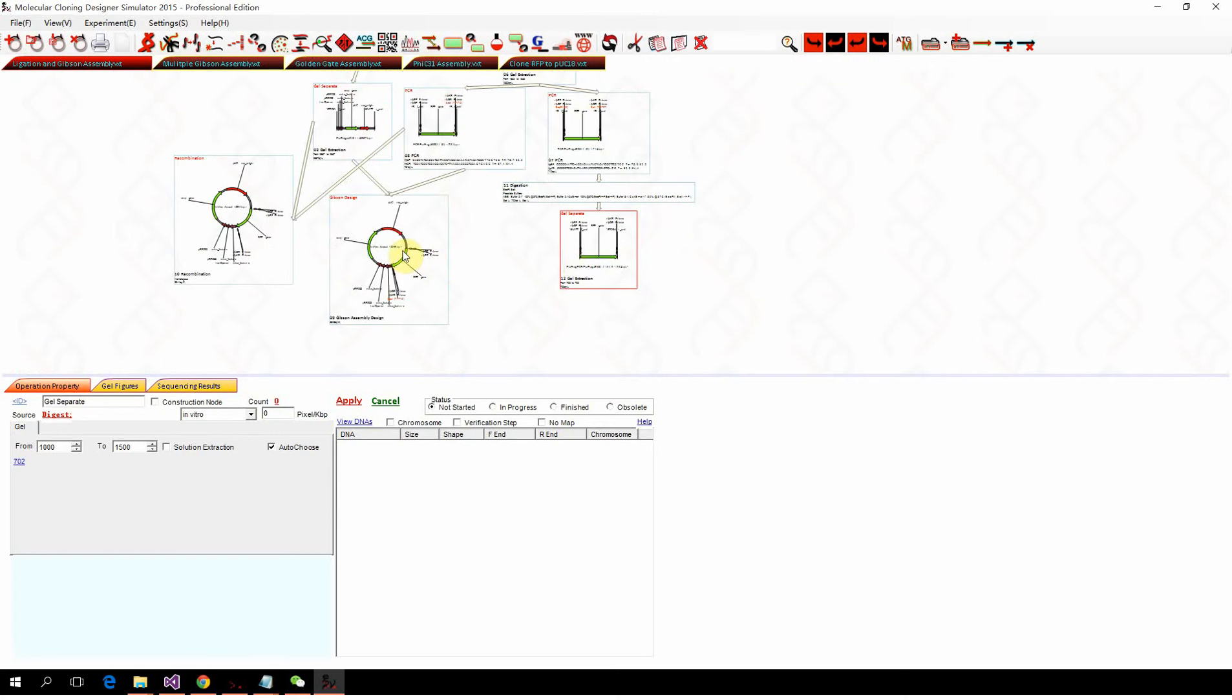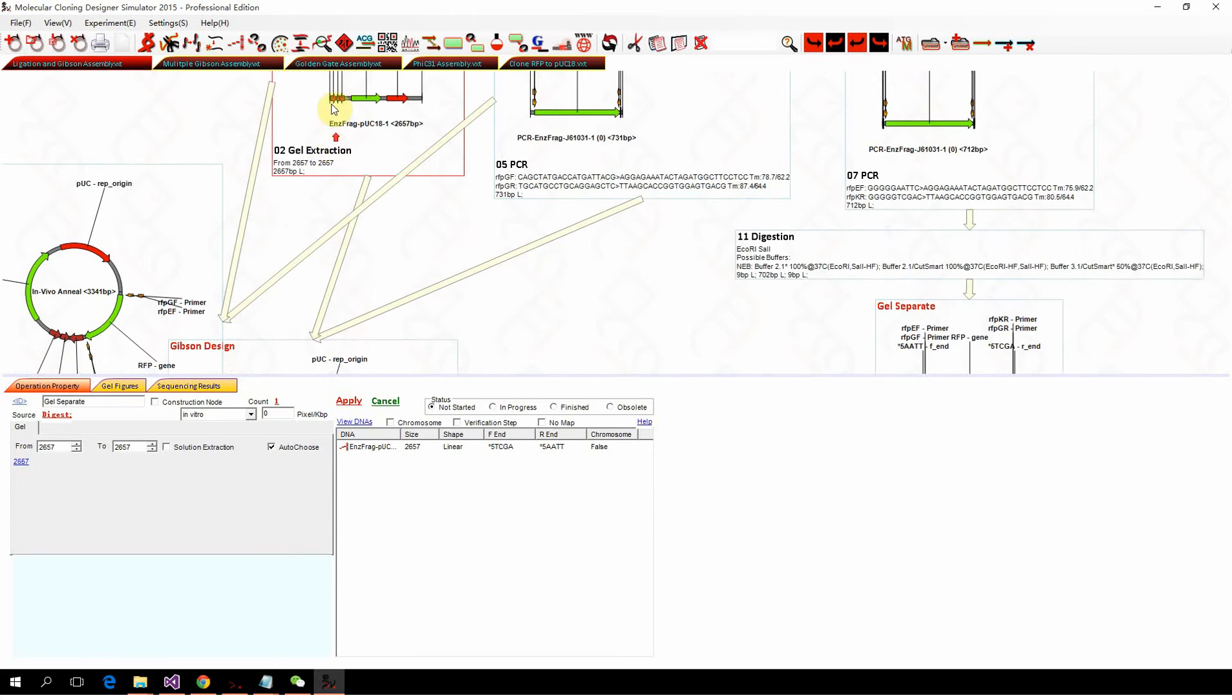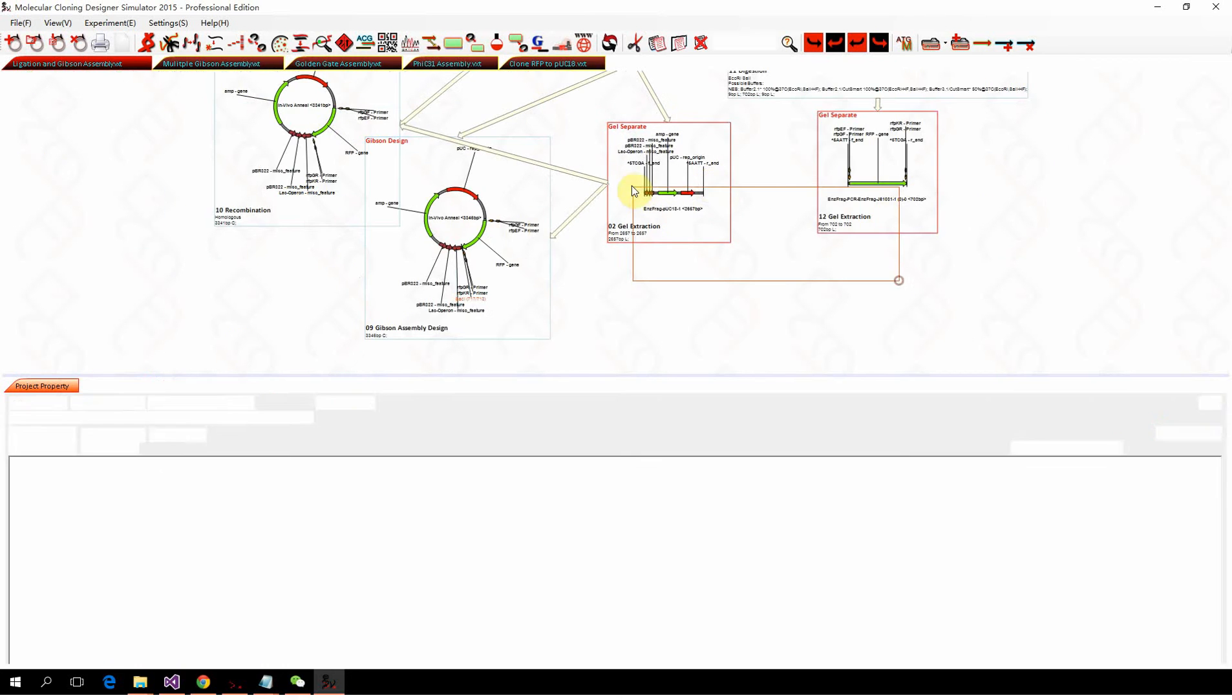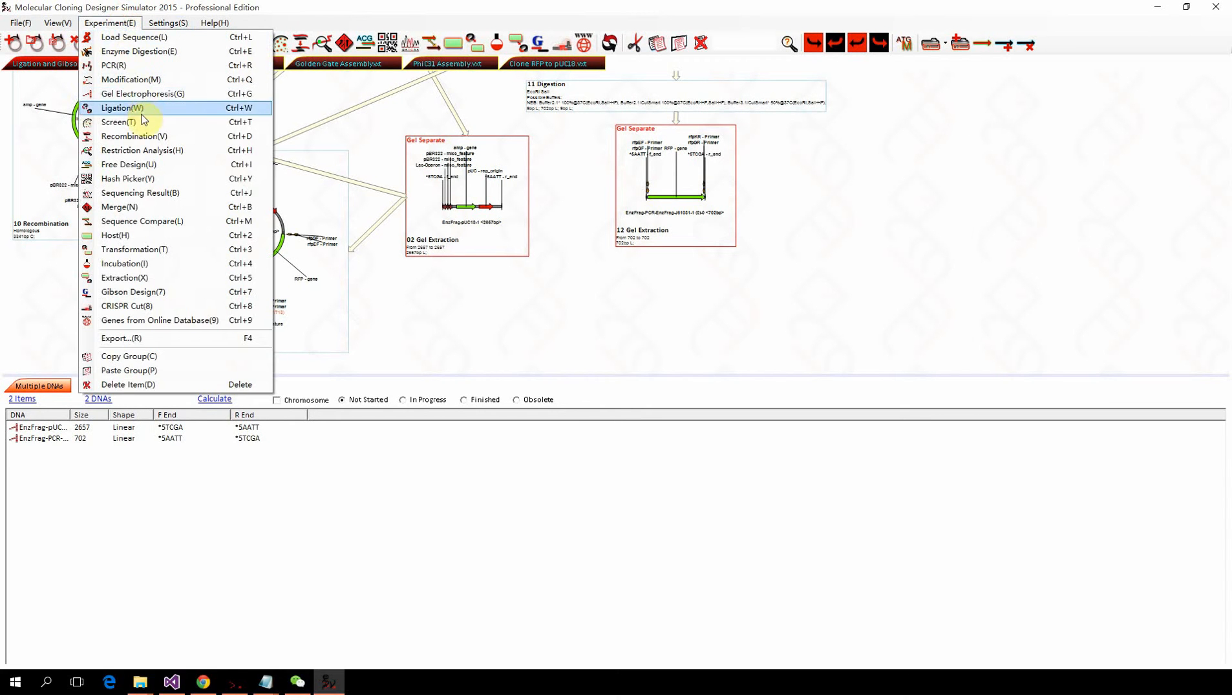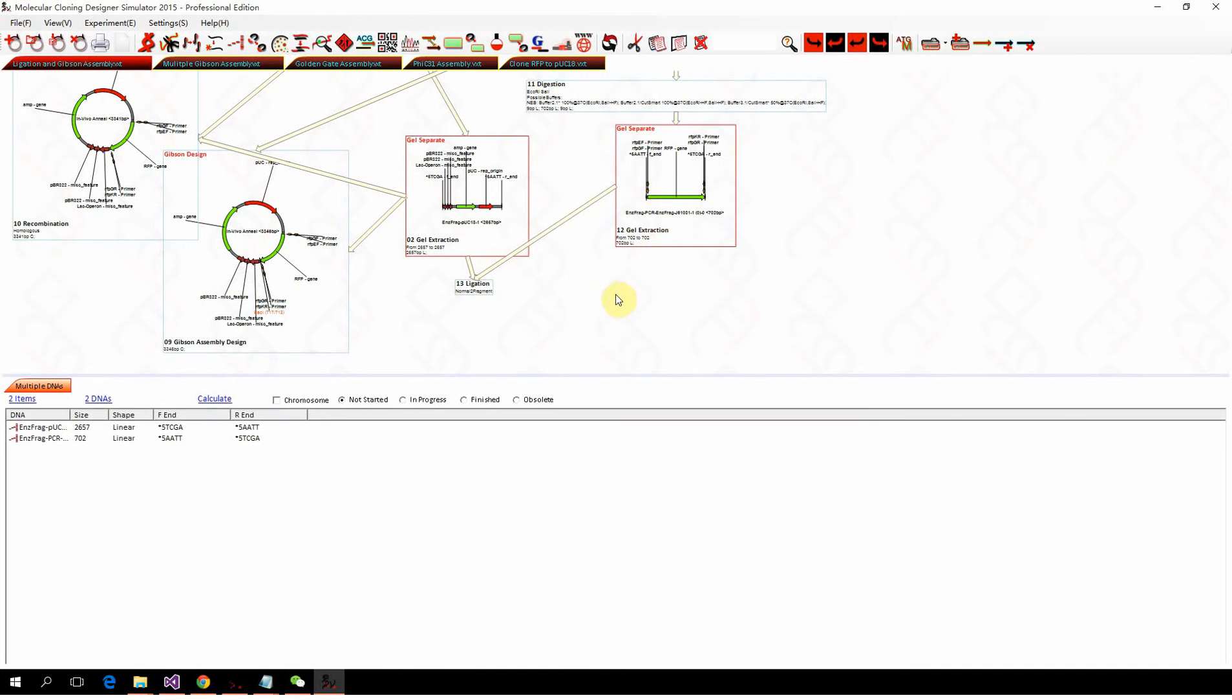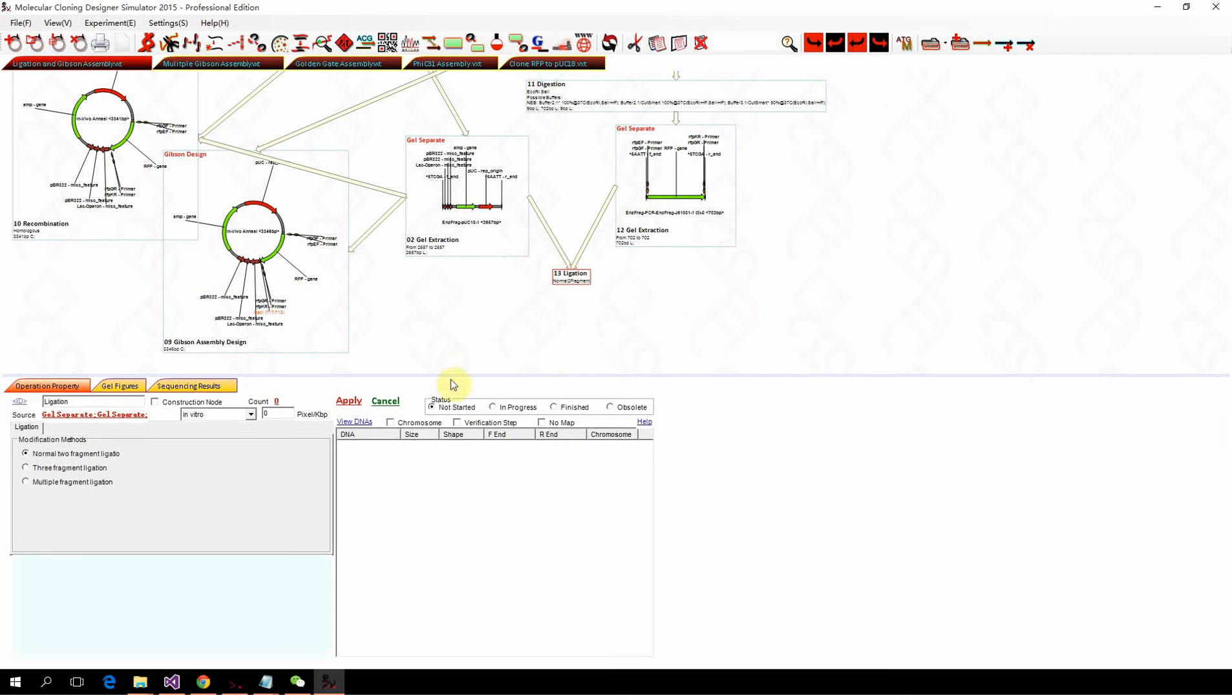We get this fragment, and with the plasmid backbone, we can perform ligation. We select both two nodes and click ligation here. You can also find ligation in the buttons, and there's a shortcut for ligation which is Ctrl+W. We perform the ligation with normal two-fragment ligation.